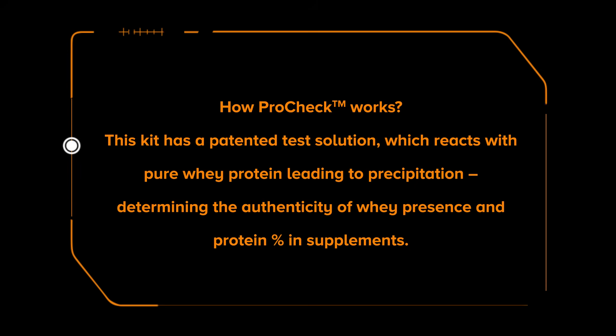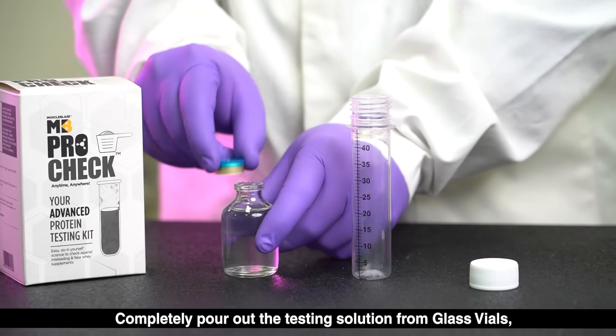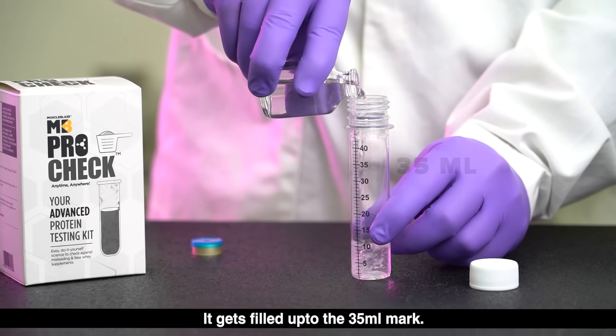Before we move further, let us tell you how this kit works. This kit has a patented solution which, when it interacts with pure whey protein, leads to precipitation. The kit uses the same phenomenon to determine the authenticity and whey percentage in samples. Completely pour out the testing solution from the glass vials carefully into the test tube.